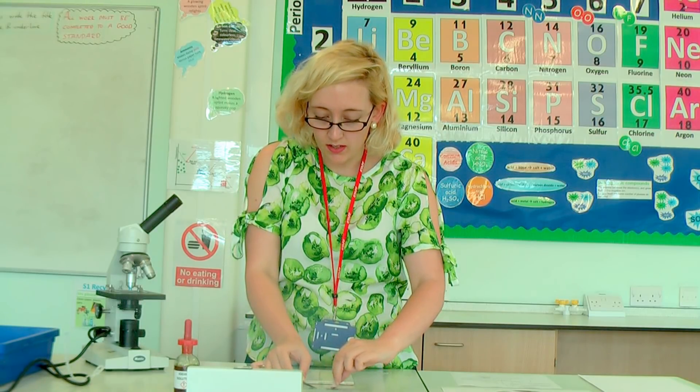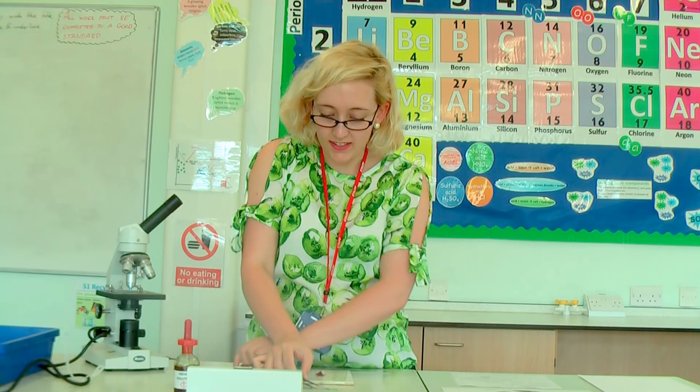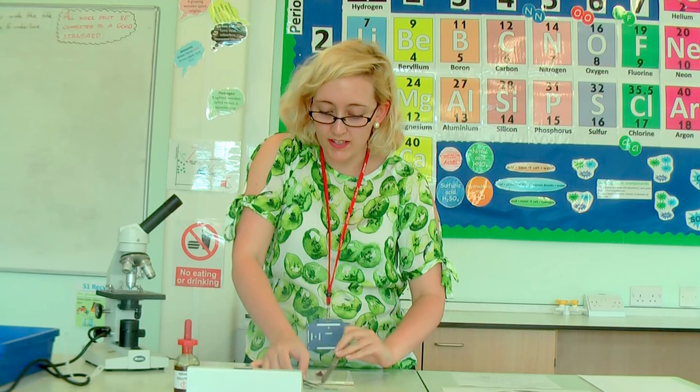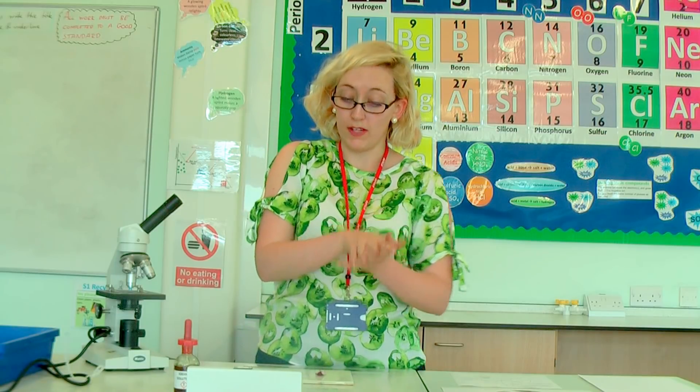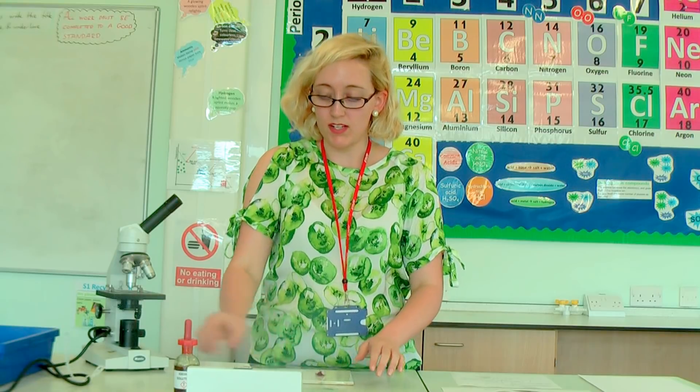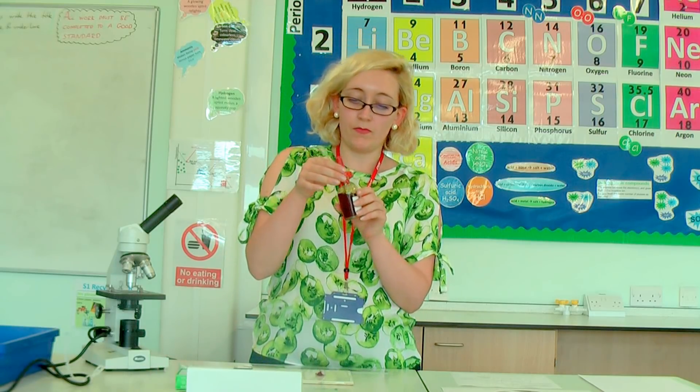You have to be quick when you're doing this. You want to get it straight down onto your microscope slide, onto the drop of water, lying as flat as possible. You don't want any bubbles and you don't want any folds. So I've got my onion skin on my slide now.